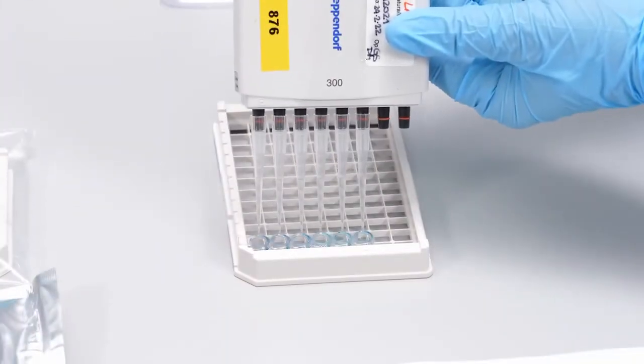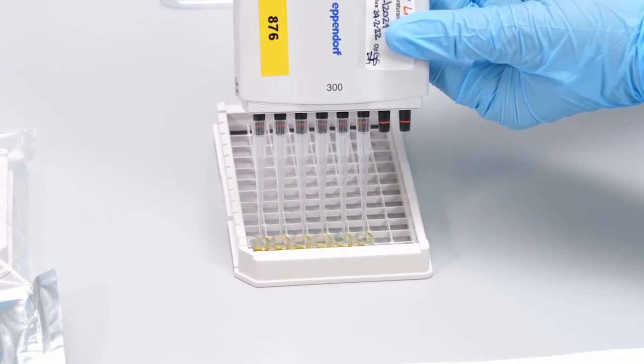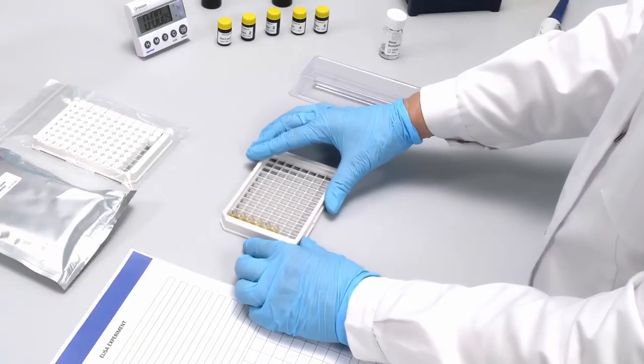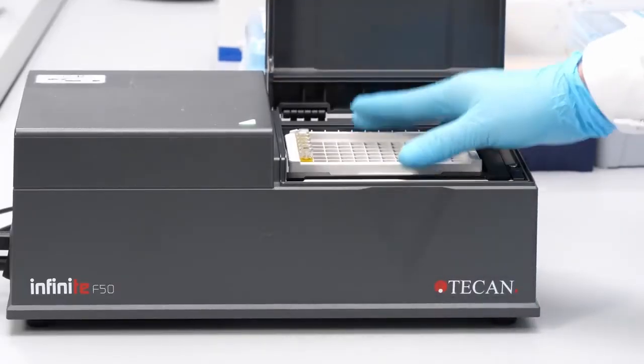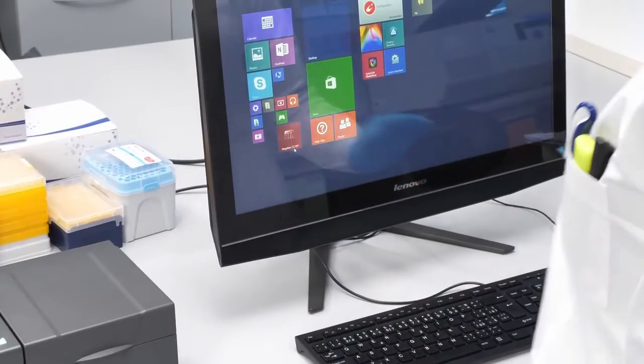Add 50 microliters of stop solution in each well. Measure the absorbances at 450 nanometers within 60 minutes.